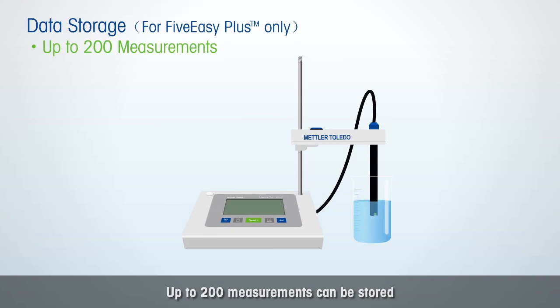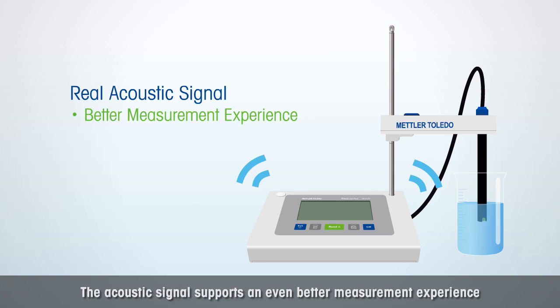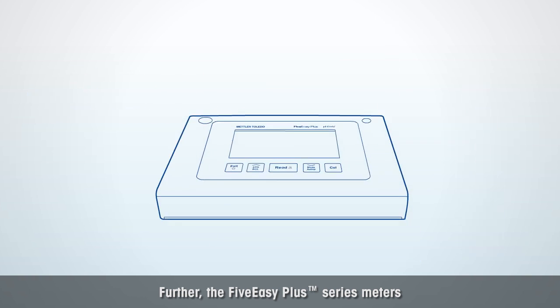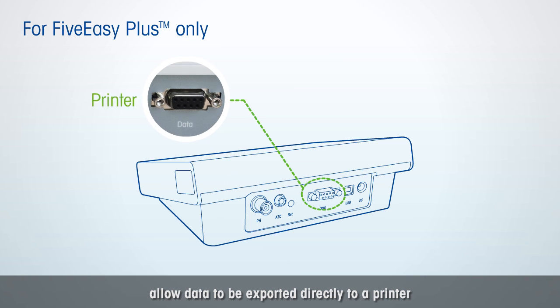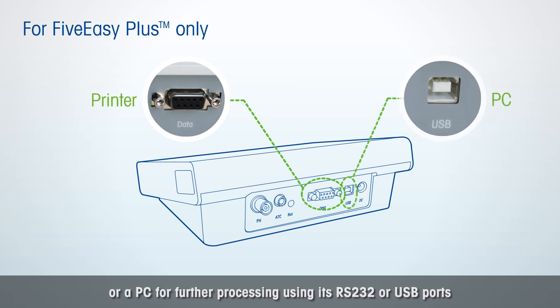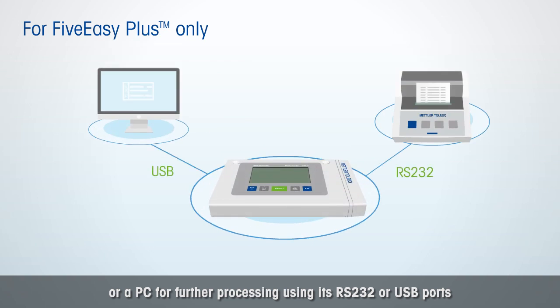Up to 200 measurements can be stored. The acoustic signal supports an even better measurement experience. The 5 Easy Plus Series Meters allow data to be exported directly to a printer or a PC for further processing, using its RS-232 or USB ports.